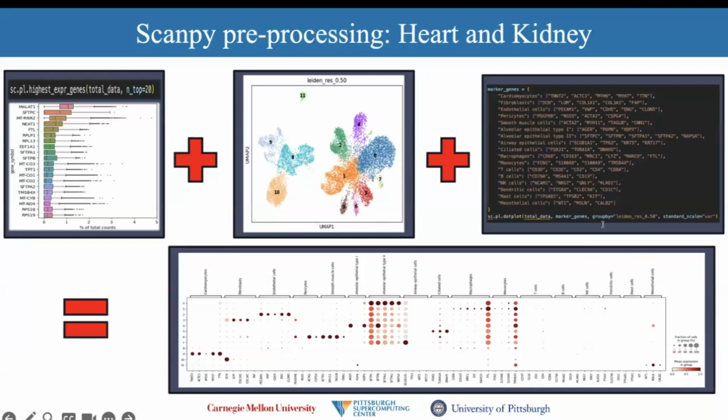And this really let me analyze mean expression of a gene within a particular cell type or cluster by their darkness. So one of those dots, the darker it is, the higher the mean expression, as well as prevalence indicated by dot size and any organ-specific differences. And this was all done before performing integration.